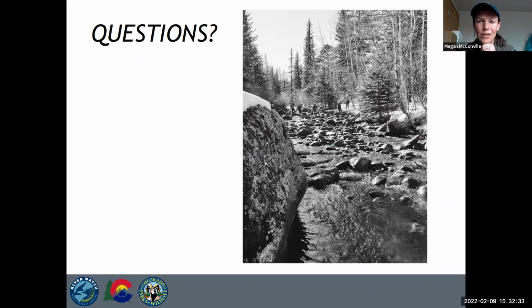All right, so that's a small snippet of the differences in these two instruments. Again, open invitation for anyone to come to our lab. We hope to have the new ICP mass spec installed this April. There'll be some startups, some initial quality control testing that allows us to switch from the optical emission spectrometer to this mass spec and continue to analyze your data.